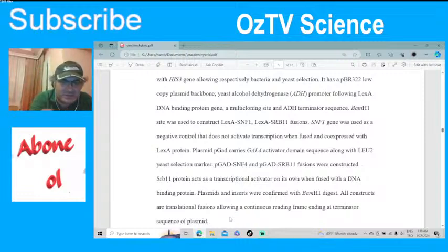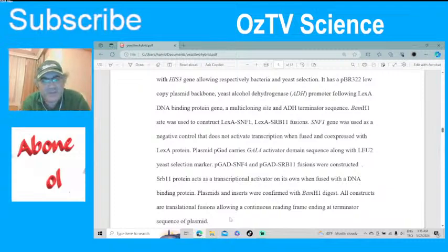With the LEU2 gene on the plasmid, you can grow the yeast on media that lacks leucine, and then it generates leucine and becomes prototroph. It's called a yeast selection marker. So this is another pGAD SNF4. So this is another construct.